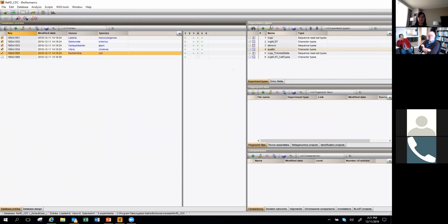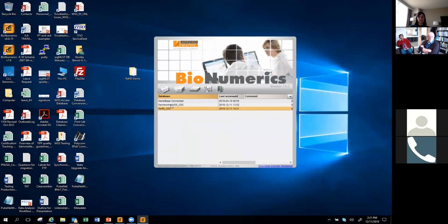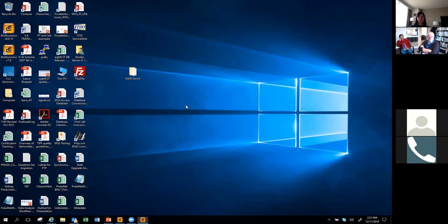So I can now close this one, and we're going to work in E. coli. So I have an Escherichia database created, so I'm going to open that. And if everything went according to plan, we should have one new entry to import.